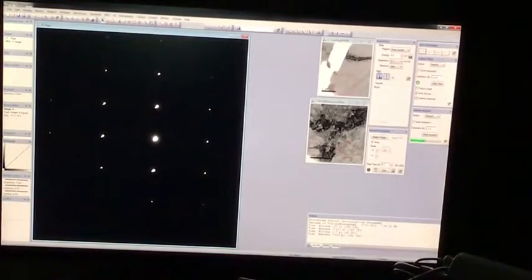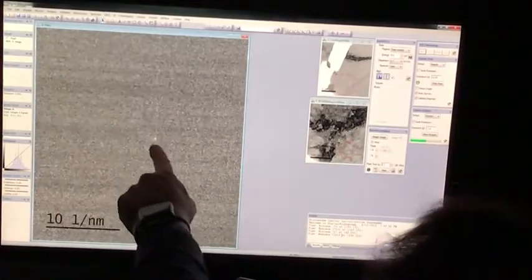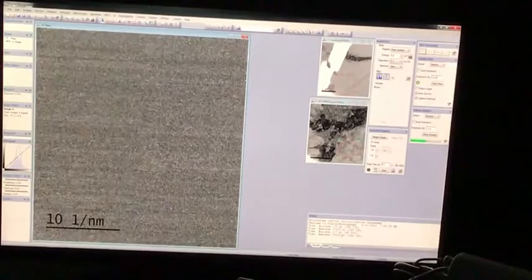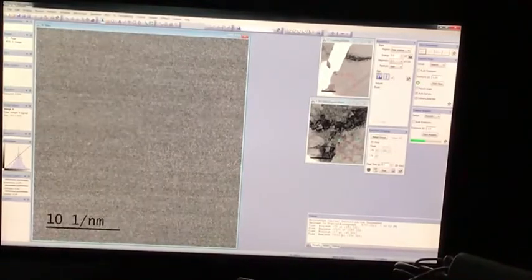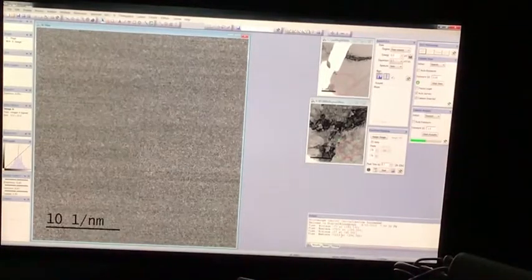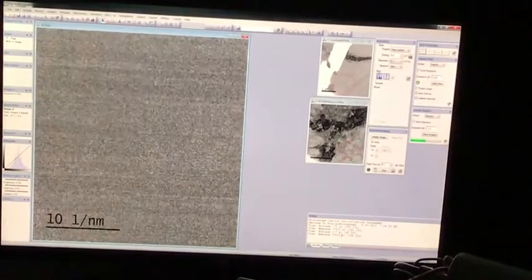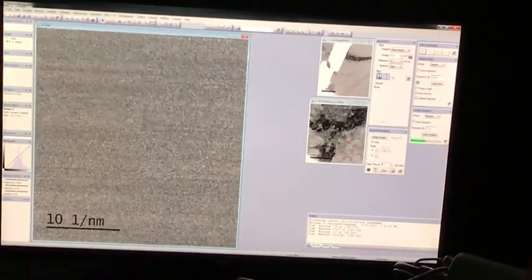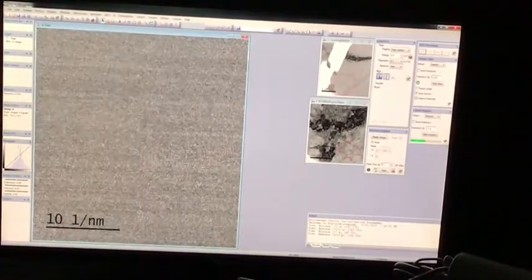Okay, I'm going to lower the viewing screen, and you'll see that memory effect there from the central beam. So I have to mask the central beam because it's blasting the detector to smithereens. And there we are. But you can infer where the central beam is. I'm just going to center that diffraction pattern.